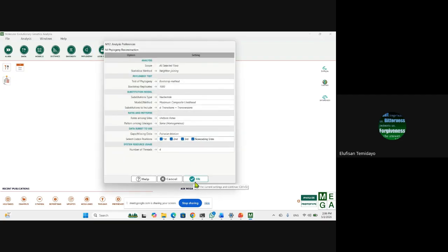You see, it's not giving me the model. Now you can also arrange this. You can reduce this if you want. You can say 500 tests of phylogeny. You can say 100 for most of them, as you are working with eukaryotes, fungi, or other microbes.